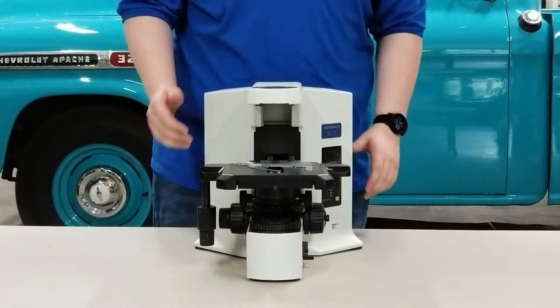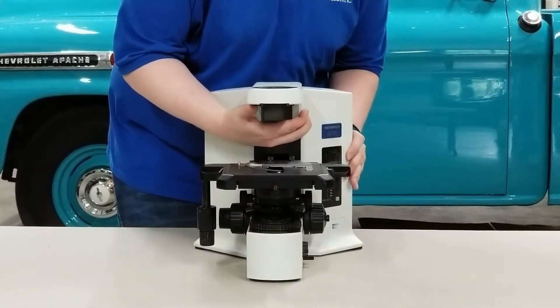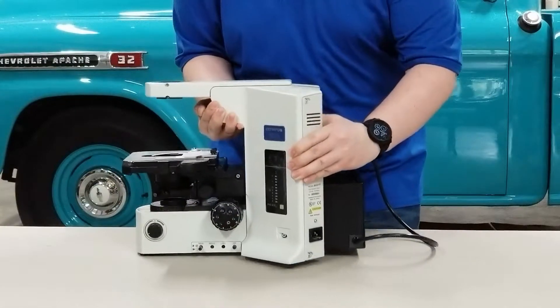To start off, you're going to go ahead and rotate your microscope, being careful not to tilt it backwards, as you don't want to damage the flange on the lamp house.